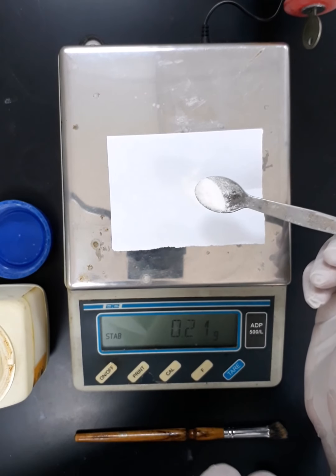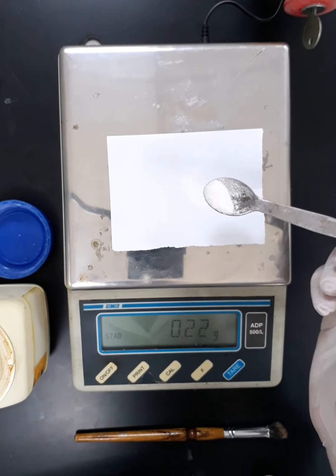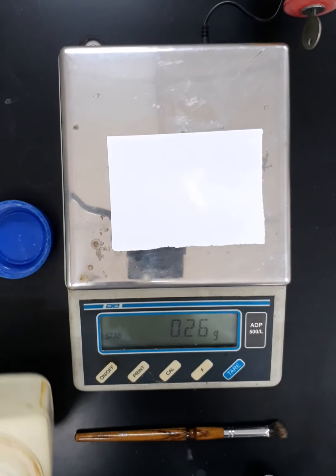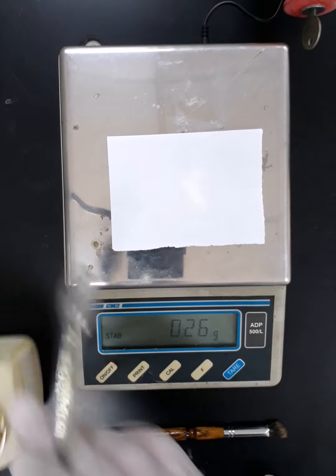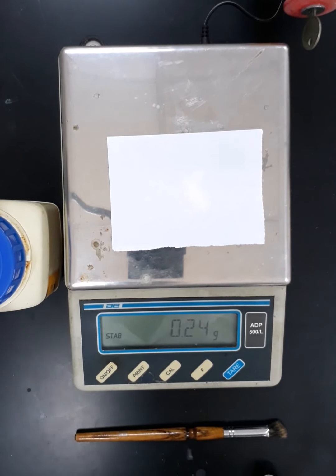I think we are too close. You will notice that the sensitivity of that balance is much less than the sensitivity of the analytical balance. So we are done with the glycine.